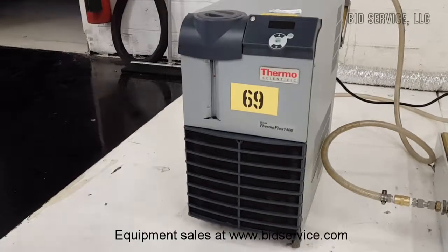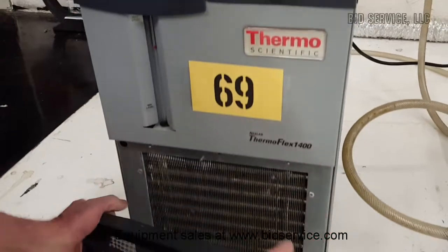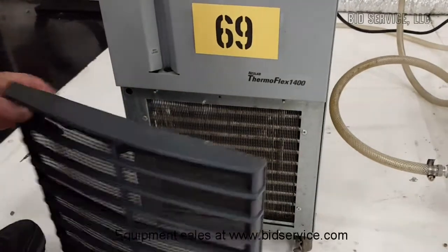I'll show you some of the features before I even turn it on. This is very convenient — you can pop this off and periodically clean all the dust out of here so you keep the condenser grill very clean.